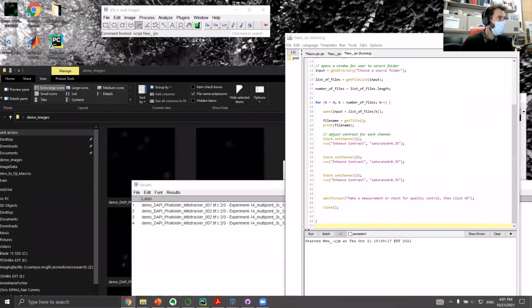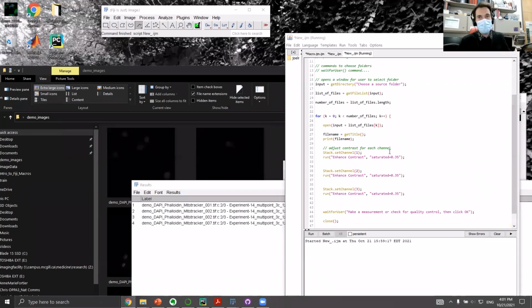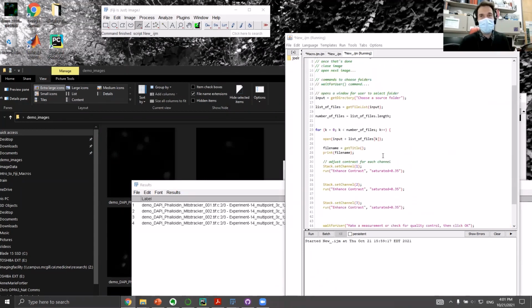It should be in the GitHub. It's not in the README. So just to finish on this, I realize people have to leave, and I'll stop there.